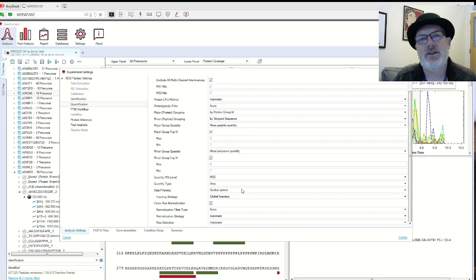So like, for example, we run into this problem all the time because a lot of people here do viral infection experiments or protein induction experiments where one group of samples should have, like if you're turning a protein on or off in one condition, and you have one condition that should have this protein expressed and the other condition it doesn't. What this default setting will do is if it's missing in one condition, it'll do an imputation method, which is basically, some people say it's like making up data, which it's really not. It's just kind of like determining the background and doing some sort of fancy imputation.